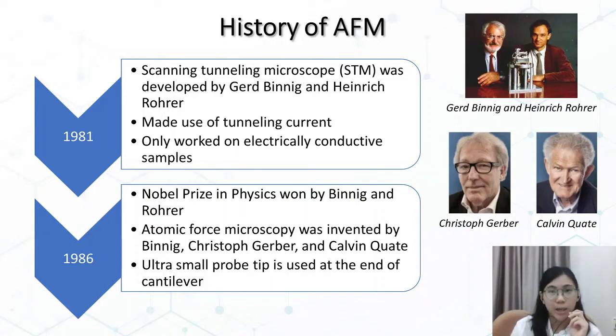Their original AFM consisted of a diamond shard attached to a strip of gold foil. The diamond tip contacted the surface directly, with the interatomic van der Waals forces providing the interaction mechanism.